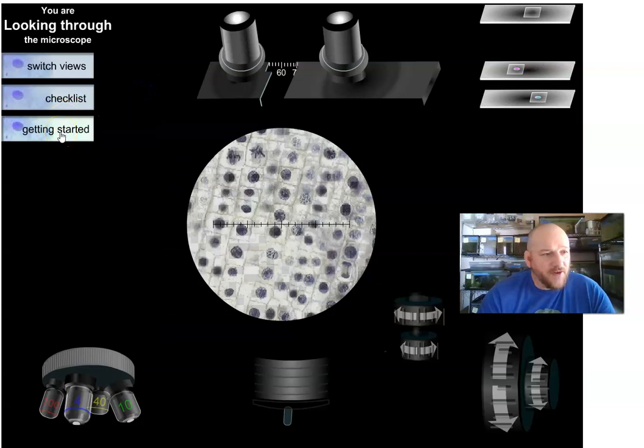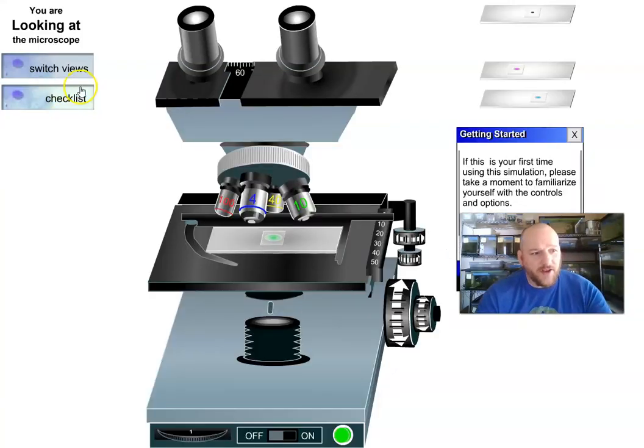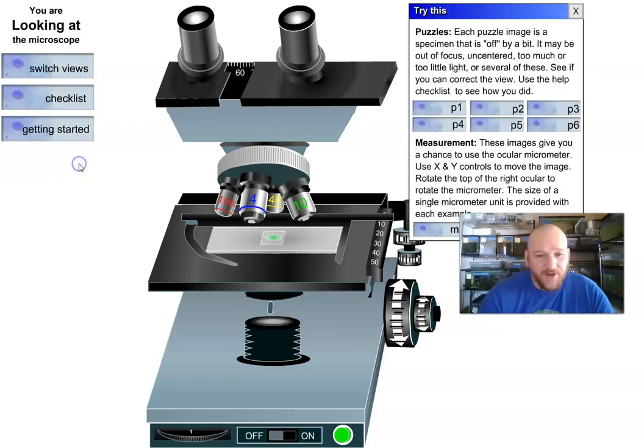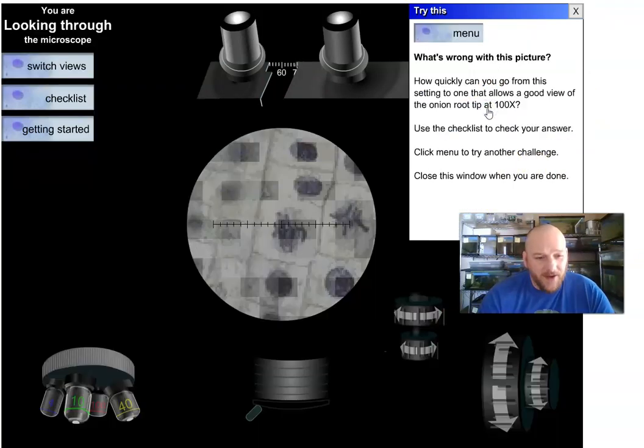There's the getting started guide here where it gives you a chance to go through things if you struggle a little bit. My favorite part is this try this option where it gives you a series of different images with different problems and it's your job to figure out what the problem is. I like that because it gives students an opportunity to experiment with their struggles.